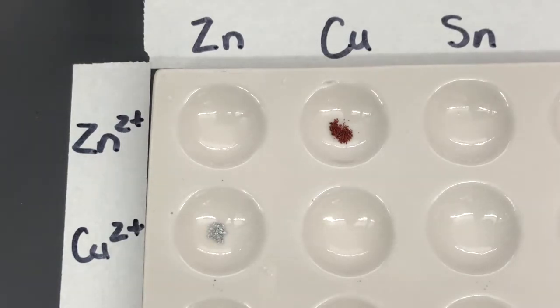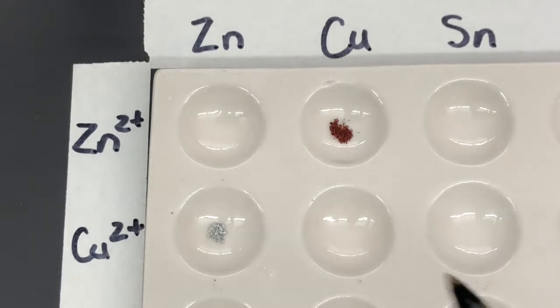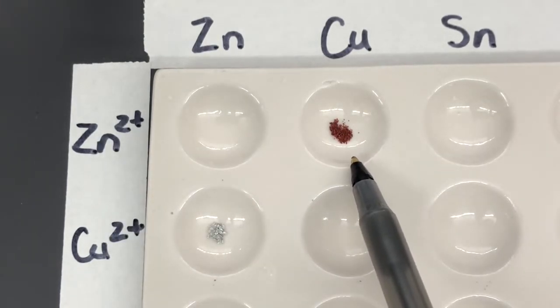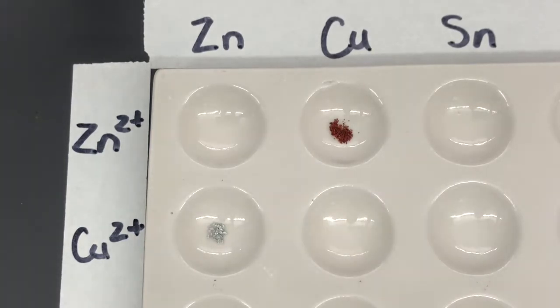In part one of this lab, you're going to explore two reactions. One of the reactions is solid copper, which is what I have in my well tray right now. And in a little bit, I'll add some zinc 2+ to the copper. Conversely, we have a second reaction that's the reverse reaction of what we're looking for when we interact copper and zinc 2+. So in this well, I have a little bit of zinc solid, and to that zinc solid, I will be adding some copper 2+.